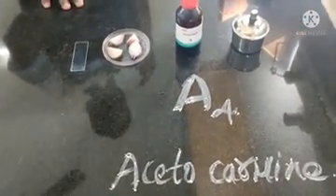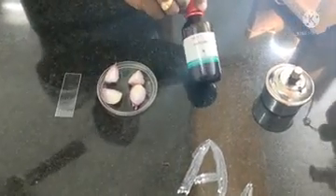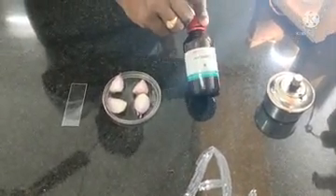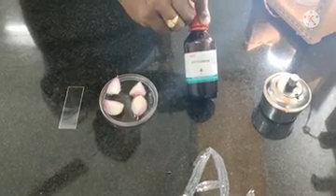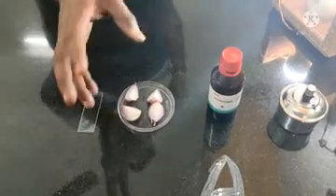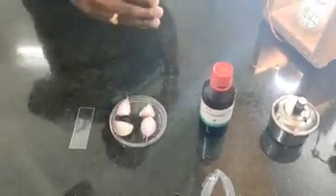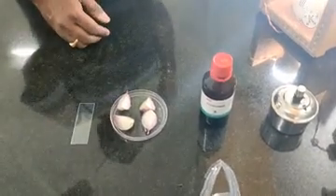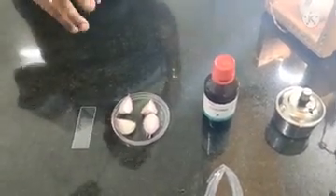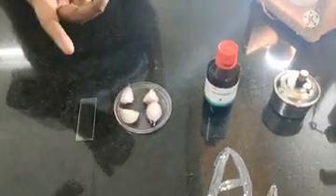Then we have A4. This experiment is the nuclear staining experiment. For this we require onion pieces, and we have to use acetocarmine, which is commonly called a nuclear stain. Using this nuclear stain, we are going to prepare a slide. Before showing this slide to the external examiner, you have to write 2 points. For slide preparation there are 3 marks. For the 2 marks, what you have to write?